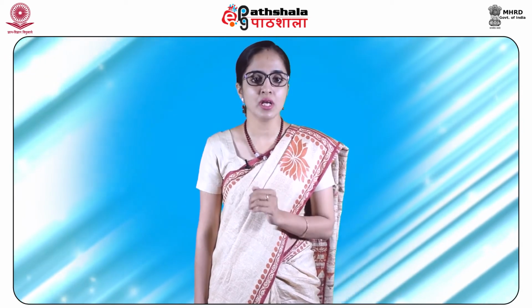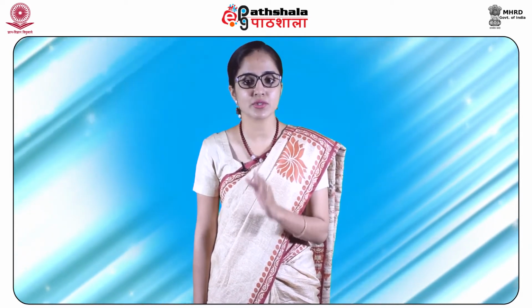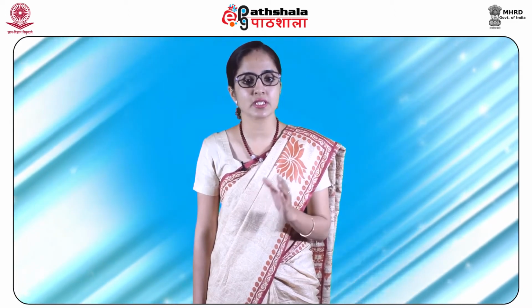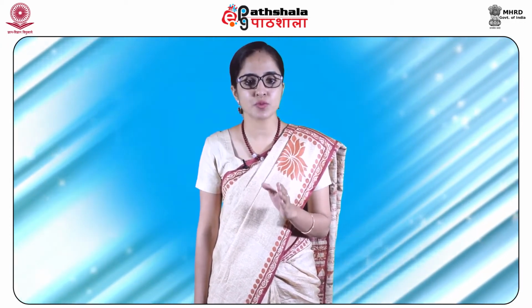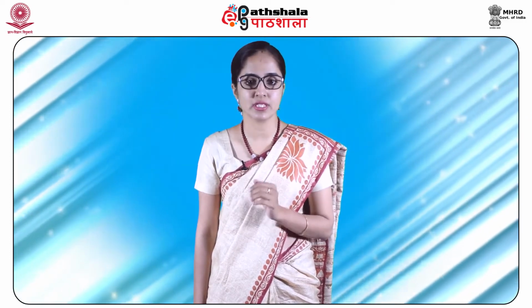Let us now come to chemical shift values. Each proton in a molecule is in a slightly different chemical environment, and hence they do not have much difference in their resonance frequency. This difference is very little in comparison to the instrument field strength, that is 60 MHz. Therefore, it is very difficult to measure the exact frequency values of each proton accurately. However, the relative frequencies can be determined with more accuracy.